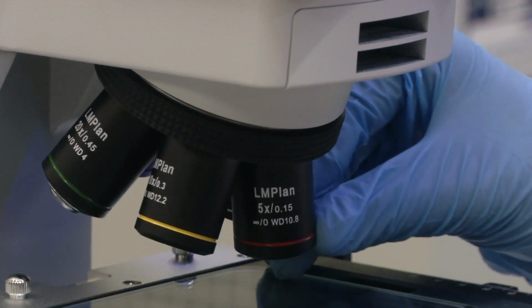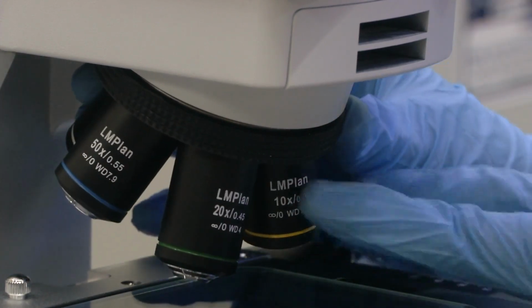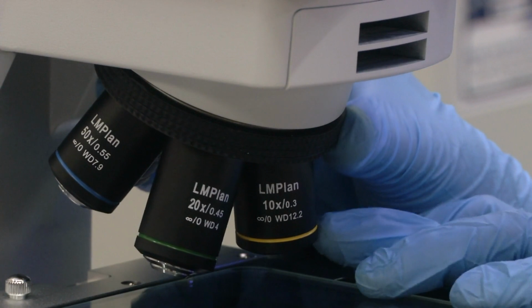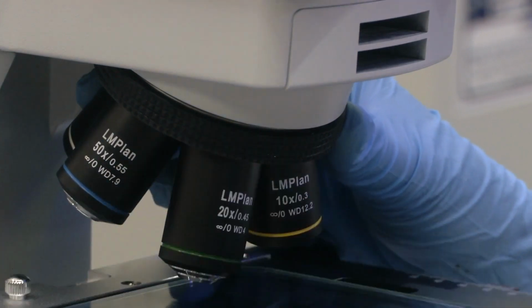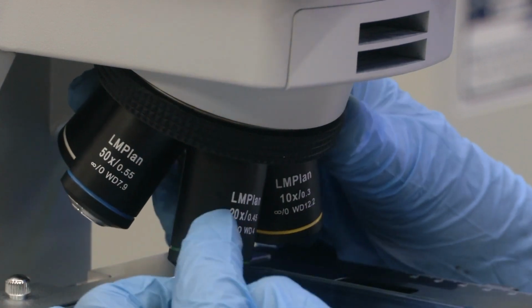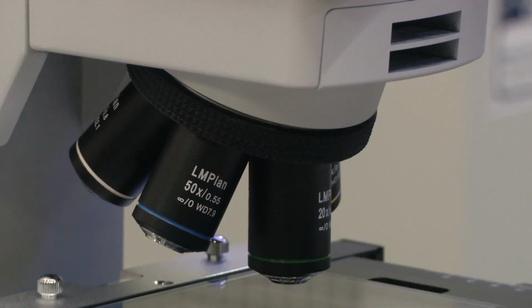As we had seen, the 5x has red color. The next objective is 10x magnification. I think you can see that also written 10x WD 12.2. That 10x objective is yellow in color. Next one we have is 20x magnification. You can see the next objective coming into position. It will keep coming into position because this is where you keep your sample. So, this is 20x magnification. Once you use 20x, 20x into 10x will give 200x effective magnification.